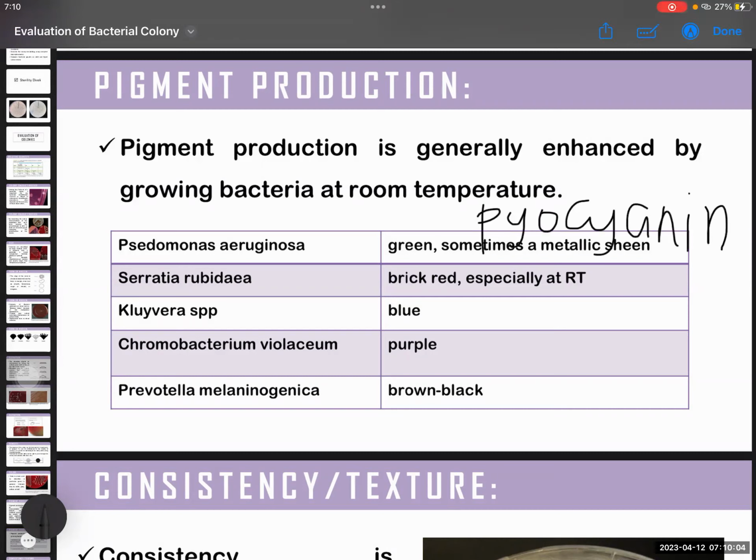It's different when we use UV light. That's a different approach, class. If you use a Wood's lamp, which is a UV lamp, it gives off a different color. That's different again, just like Prevotella, I think, or Veillonella. So the natural pigment and the color produced when they are exposed to a Wood's lamp are different.